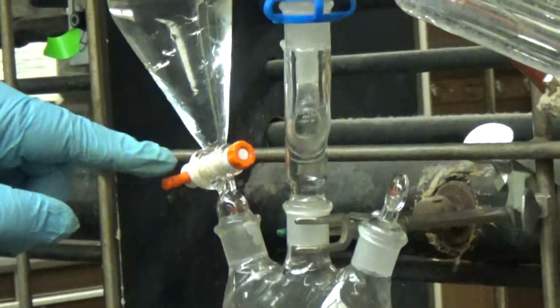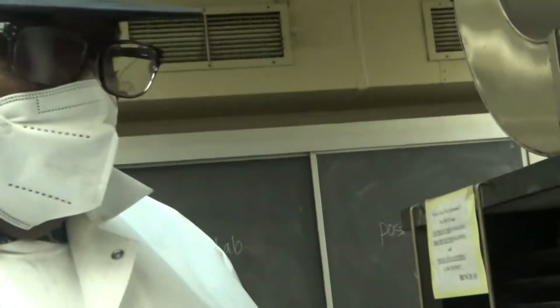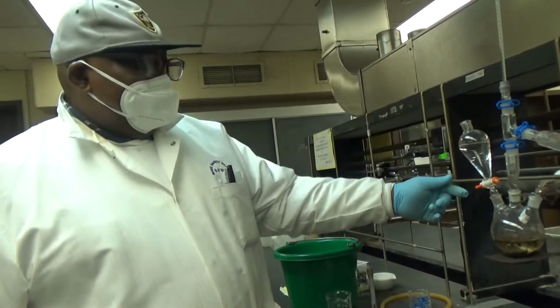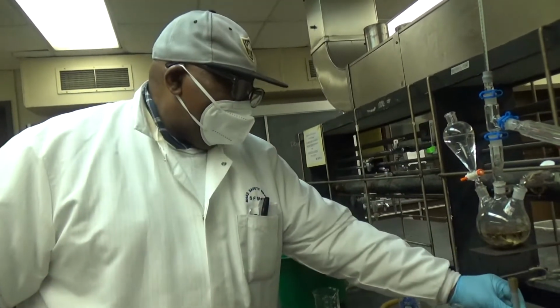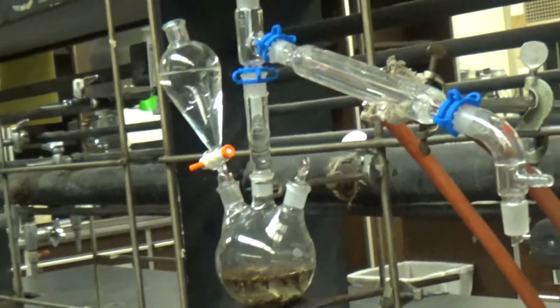Now let's say this one. When you distill, it's always boiling, vaporizing, condensing. When you boil the water, the amount of water is going to decrease, and you can add more water from here as it's boiling away. So that's why you have that second thing on the top. Yes, absolutely, for steam distillation.